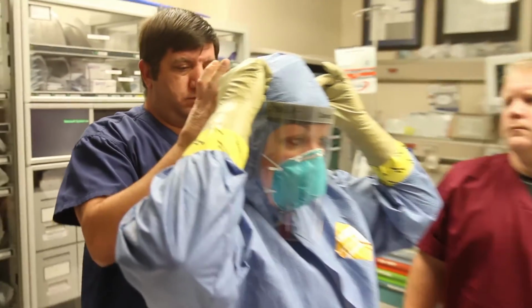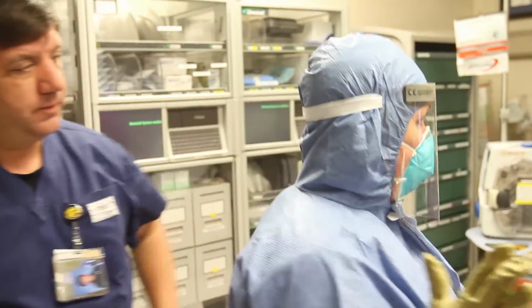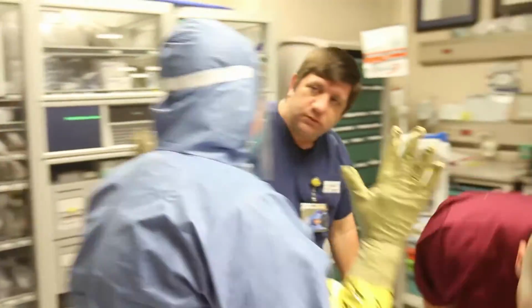And this is a multi-person job to put this together. This is to make sure that we're safe. We're going to have 3 people doing this job.